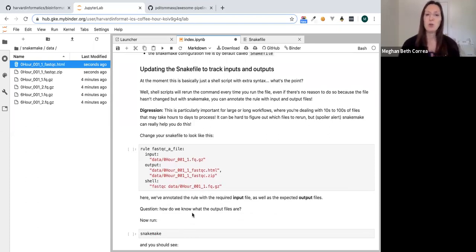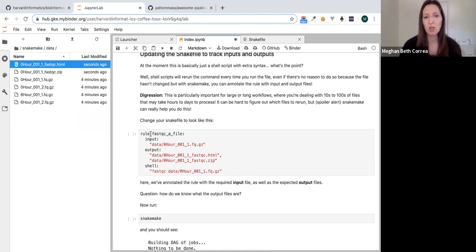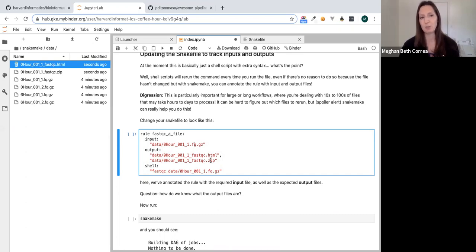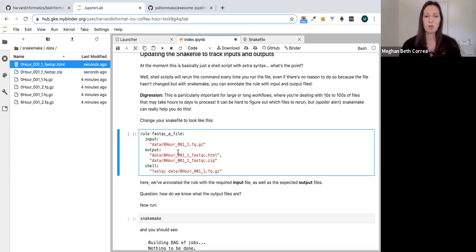To enable re-entrancy, we define inputs and outputs for each rule. For our rule fastqc_file, the input is the FASTQ data file, and as output we expect a .html and a .zip file. The body of the command will be FastQC on the data file. Let's try this updated version.